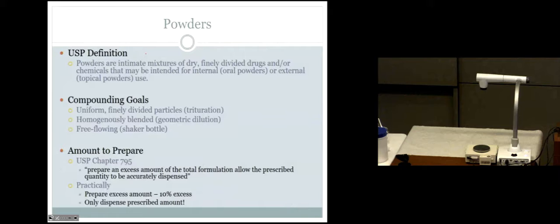Okay. So today, what is your wet lab? What are you going to be compounding? We are doing what form of powder? Internal or external? External. You're making a topical dusting powder. So applying drugs exterior to the skin topically. Do you hardly ever compound powders for internal use?